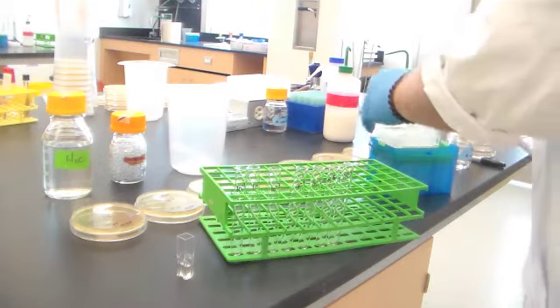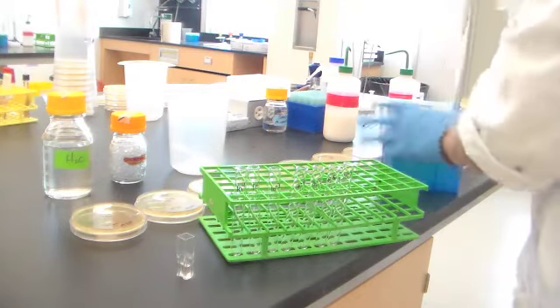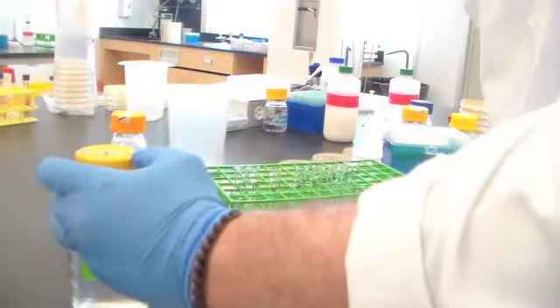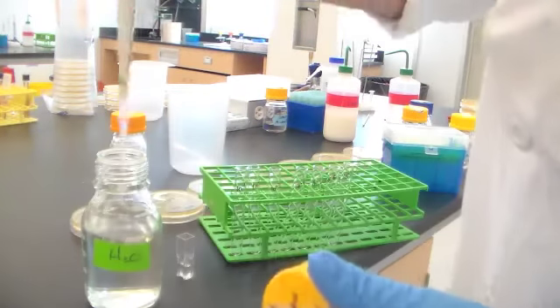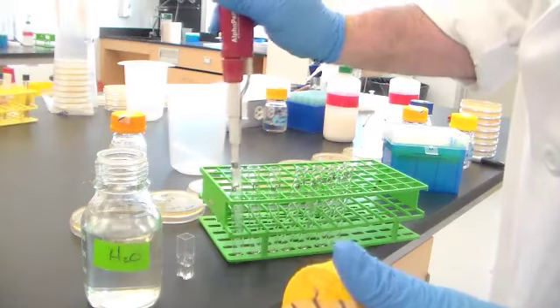And now I also have out autoclaved sterile distilled water. I'm now going to transfer 900 microliters into each one of these tubes.